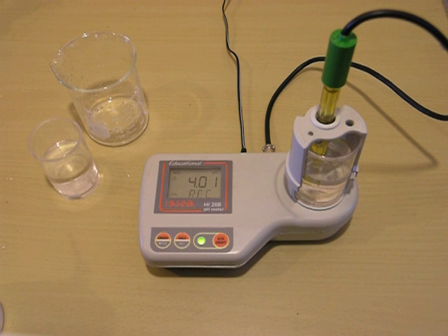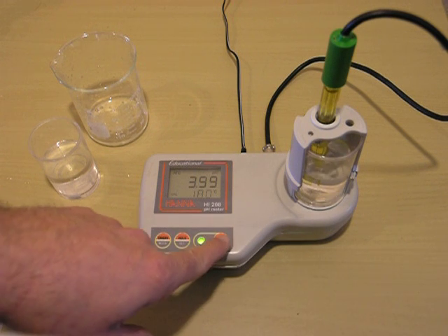Turn the stirrer back on. When the machine's done calibrating, it will go back to its normal stage. We have two-point calibration and we're back to our standard stage. Remember, it is temperature compensated, so if it doesn't read exactly 4.01, it's okay — it's just being compensated by the temperature. We'll turn our stirrer off.